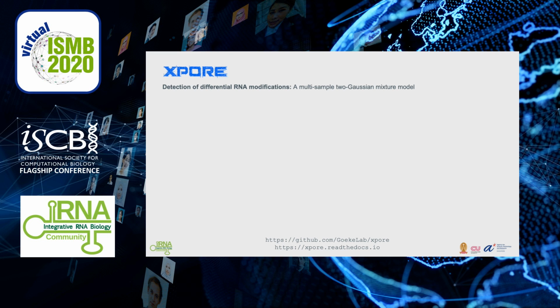Let me give you a GGACT site as a use case to describe how the model works. Okay? Imagine this site has many reads from 3 samples shown in 3 different colors here. As we have seen before, when modified reads are mixed with the unmodified, we see a gap in the intensity level, which turns out to be a bimodal distribution in the density plot.